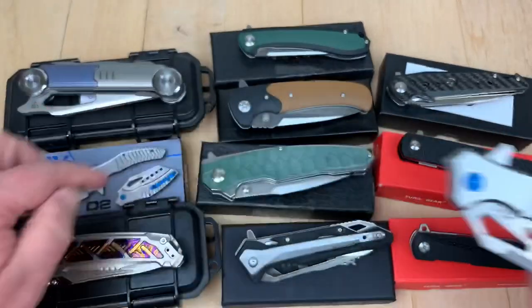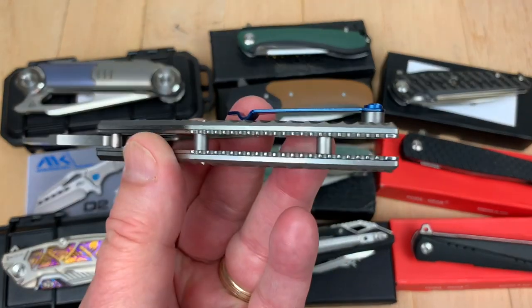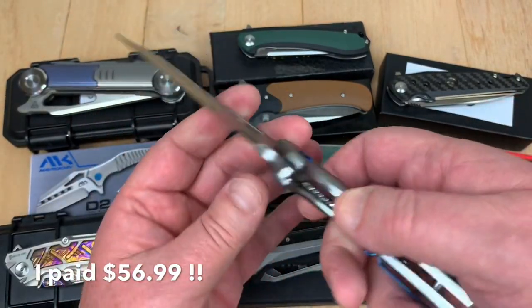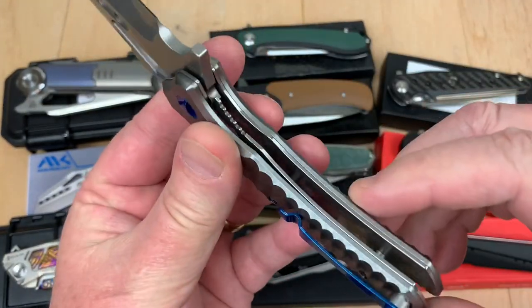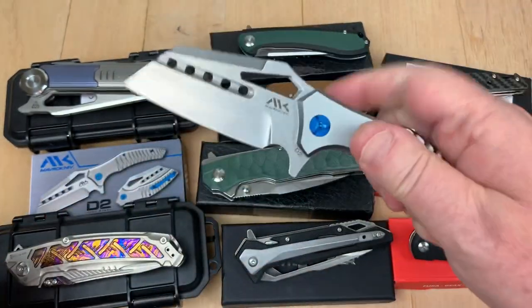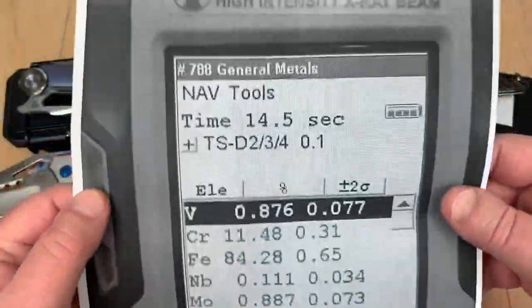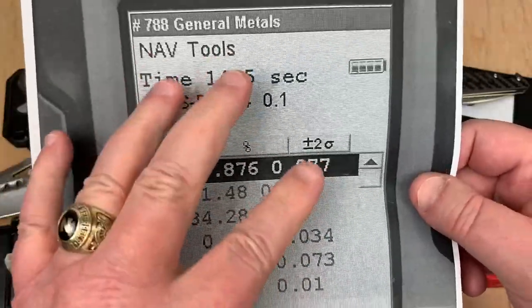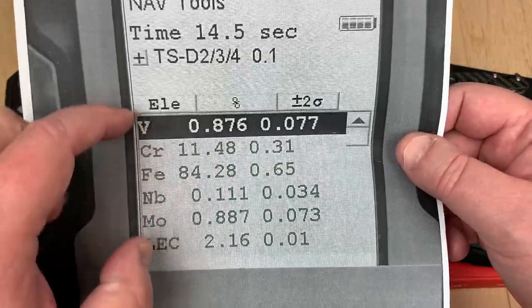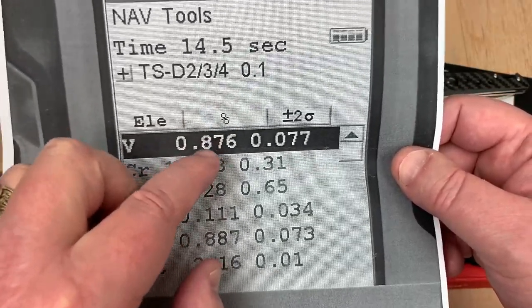The next one is the Mavro Niv. I got this off eBay and I just thought, what a crazy, funky design. I think I paid all the money anybody should pay for this knife, which was 50-something dollars. It's a liner lock — aluminum handles with steel liners — and they're not skeletonized or anything. Not a whole lot of hard work went into this. But they said it was D2, and I go, yeah, right. So, is it? Here are the results. You can see it's an 11% to 12% chromium tool steel, there's the vanadium coming up on 1%. Not bad actually.